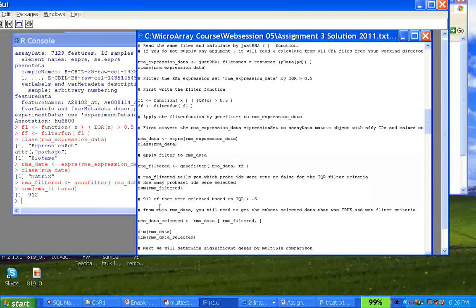And as you go along doing other homeworks, that's all we're trying to do. We're starting from 20,000, doing a non-specific filter, going down to maybe, I don't know, 5,000. And from 5,000, we do a t-test, then you go down to like 2,000 or 200. And based on the 200, you apply some hypergeometric test and GO annotation and pathway mapping. So end of the day, you may end up just finding 4, 5, or 10 features. Then you ask the question, does it make sense biologically? Do I find these in any kind of literature? If it doesn't, throw away the analysis, do another one. You have to do several iterations of it. So it's a hunt. Many people are successful, some are unsuccessful, but that's pretty much the process here.